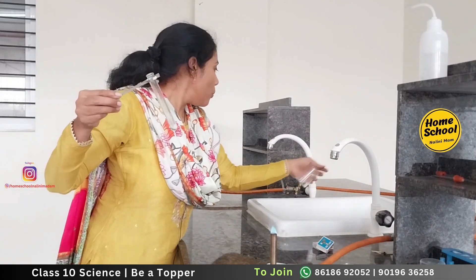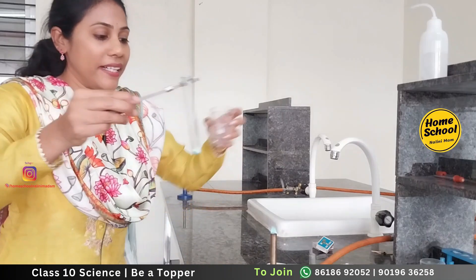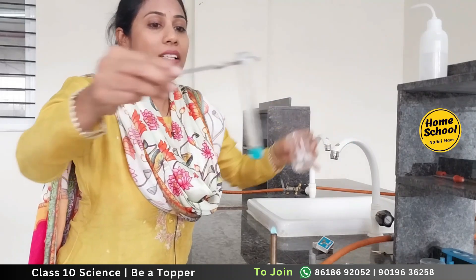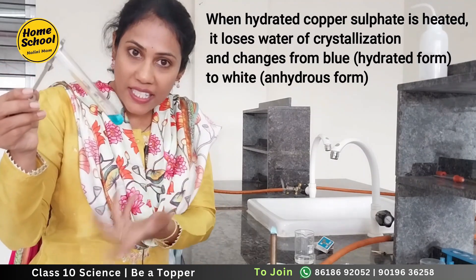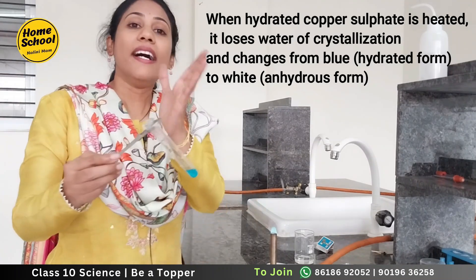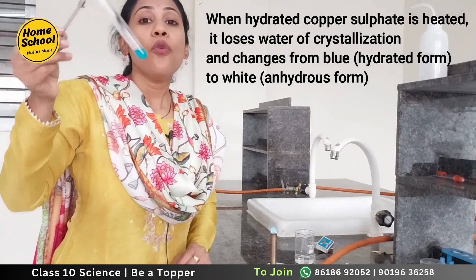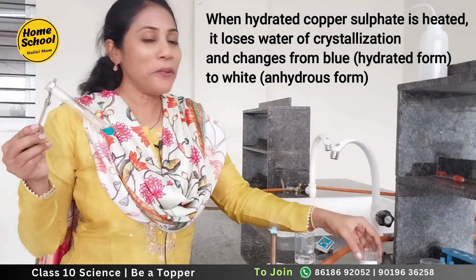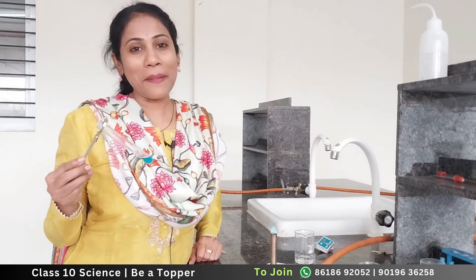Now if I add water back to the white crystals — I'm adding some water onto the white crystals — I get blue color back! Because I added water, each crystal got its water of crystallization back, and blue color reappears. The moment I heat it again, water of crystallization evaporates and it becomes colorless again. That is all about the video — hope you enjoyed the content. Please share your opinion in the comment section!